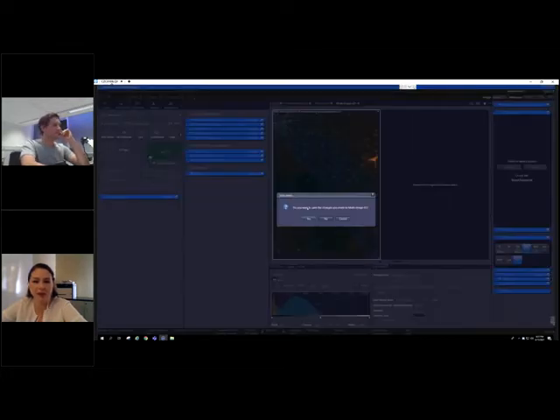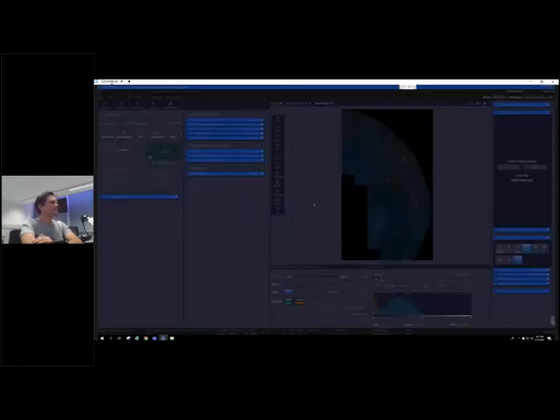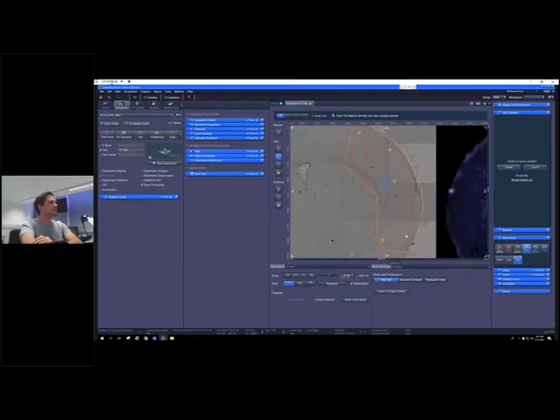All right, so in the next experiment, let me show you how this looks like on a 96 well plate. Okay, so let me quickly clean up here, and then let me just insert a 96 well plate into the microscope stage.